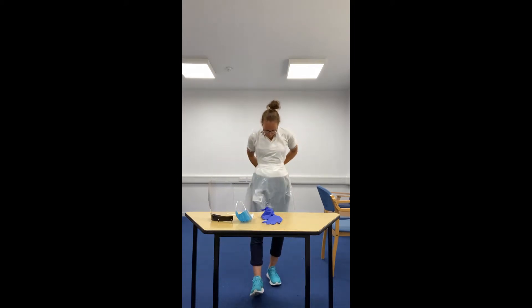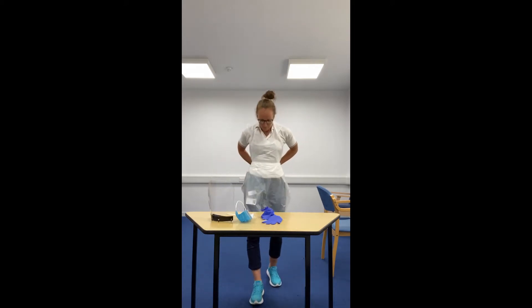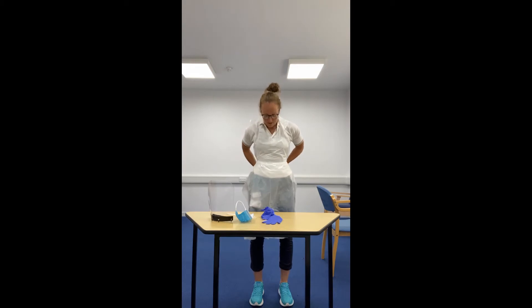We're going to start off by covering our body by putting on your apron. Then we're going to think about covering our faces — we want to be putting on our face mask and then our visor.